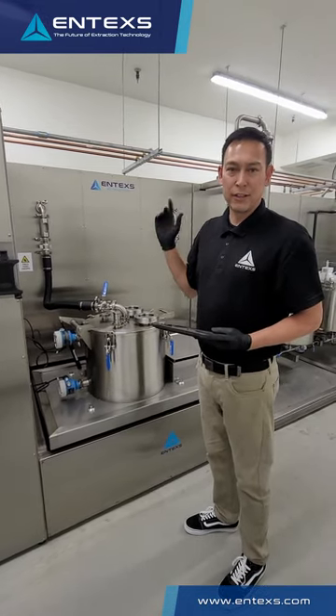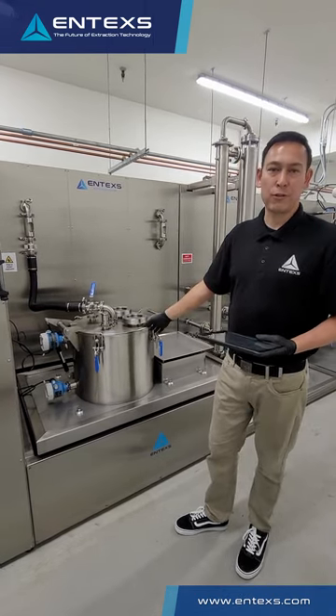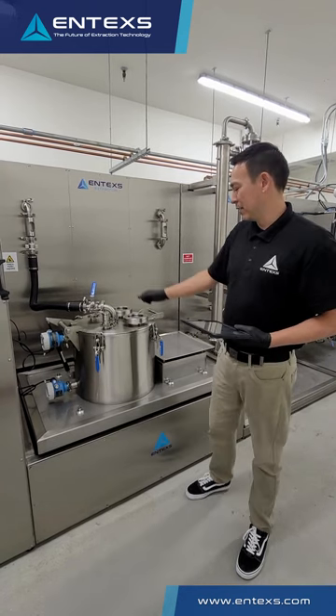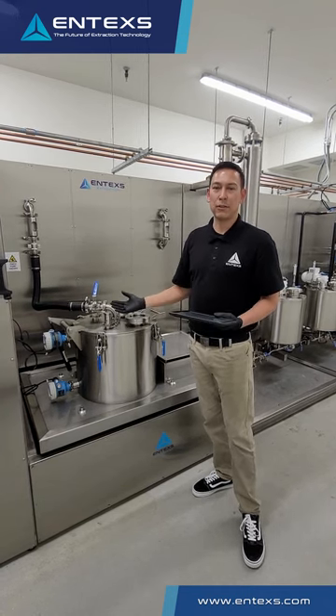it fills, extracts, agitates for the required set time, and then centrifuges the solvent out of the biomass. After that process is complete, your biomass comes out, your next bag goes in. That's the extent of the manual labor that goes into this piece of equipment.